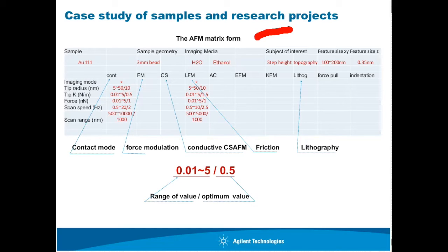And I'm going to have this form available. If you email me, I will pass you the latest form, and maybe I can periodically post the form on some social media, and then you can download it. And I try to make suggestions of what tip to use, what imaging mode to use, using this form. So this form contains several parts. Let me expand a little bit.